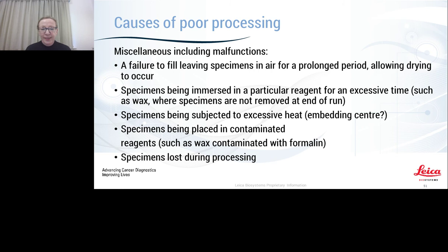Miscellaneous. So a failure to fill, maybe specimens are left in the air for a prolonged period, allowing drying to occur. Maybe the specimen's been immersed in a particular reagent for an excessive time, such as wax, where they're not removed at the end of the run. Specimens being subjected to excessive heat, could that be at the embedding centre?